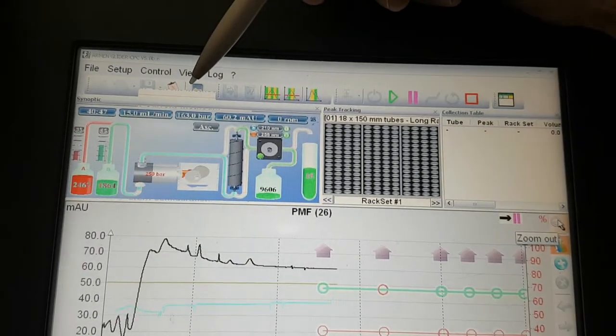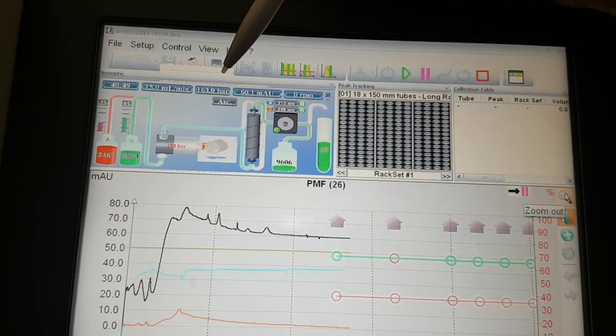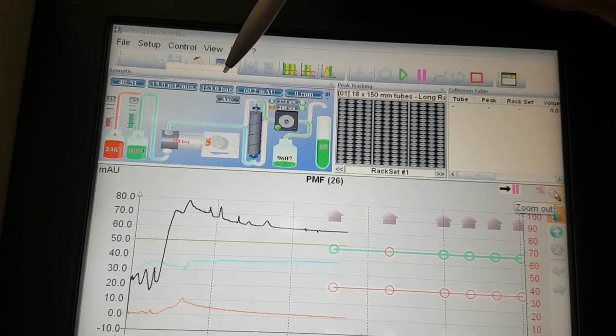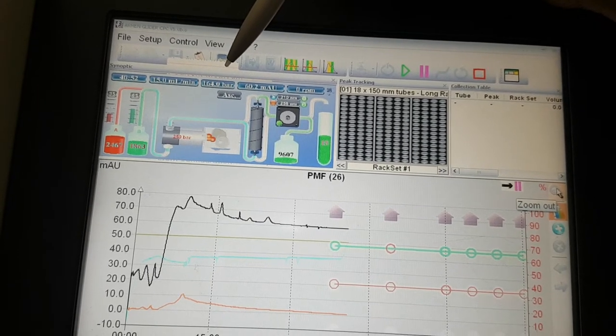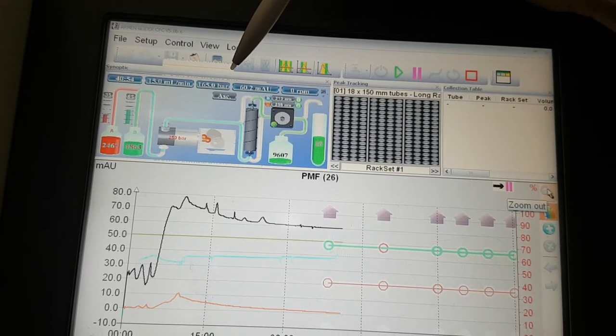The pressure is the most important factor in the progress of chromatography technology.